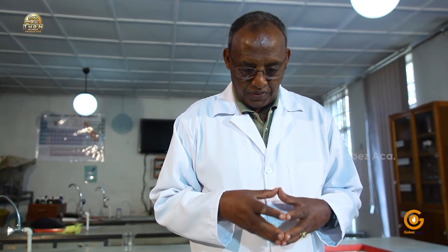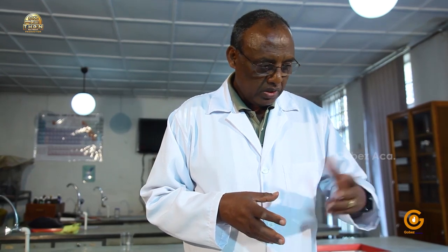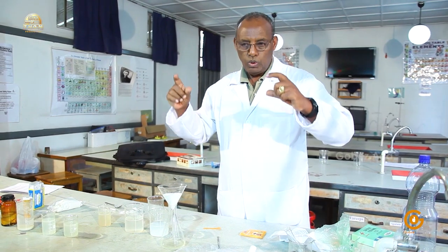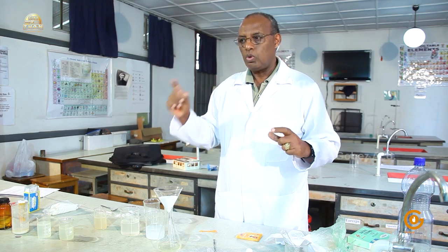So through today's experiment, we have been able to demonstrate that these factors affect rates of dissolution. On the side, we've seen two colorless solutions of silver nitrate and sodium chloride.